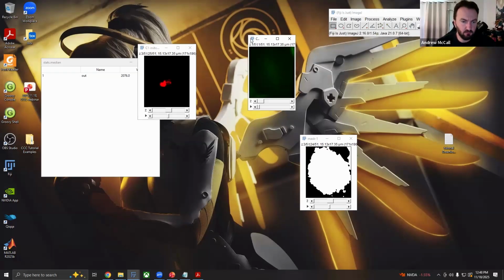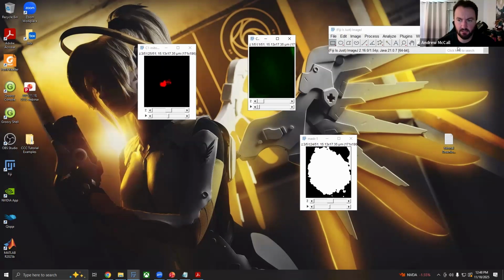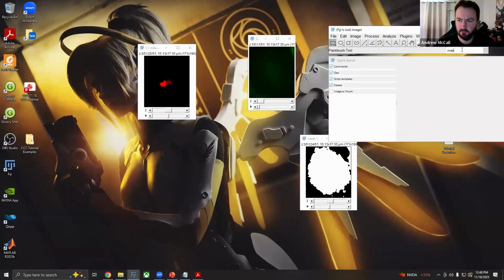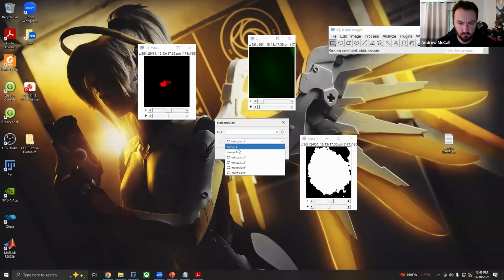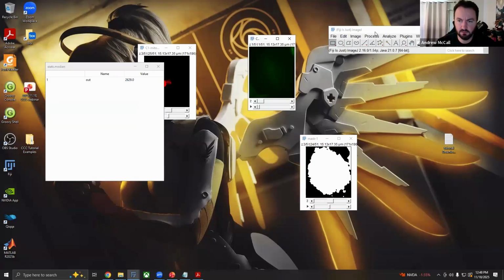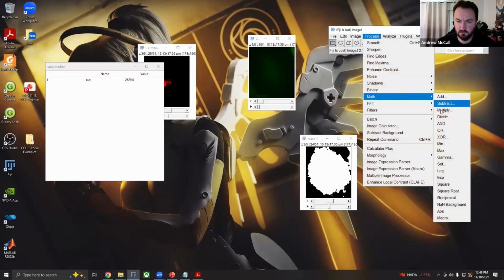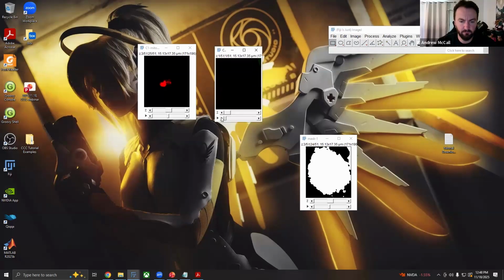If you want to play around with it, you can not do that and see the difference. The confidence values will be extraordinarily low. And then we're just going to repeat the same thing with channel 2 here. So median, Stats, Median, select channel 2, click OK, 2629. So come here, Process, Math, Subtract, 2629. Click OK. Yes. So there we go. There are 2 images. Okay, and these are what we're going to use.